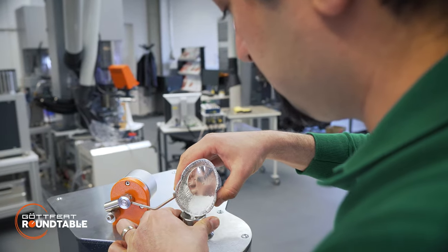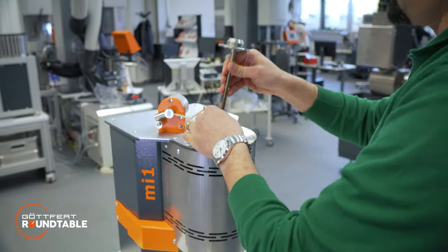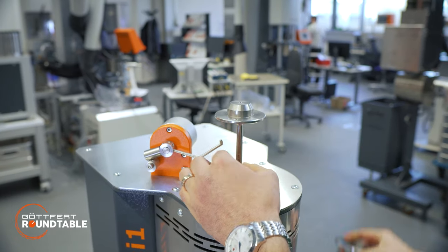Then you can start with the measurement. After the measurement, you will get the results on the notebook and the results will be saved on the instrument.